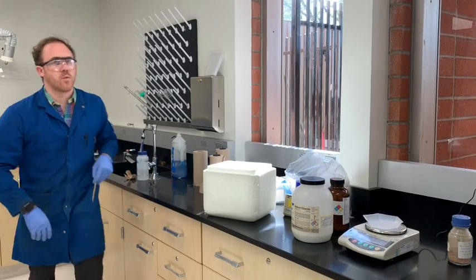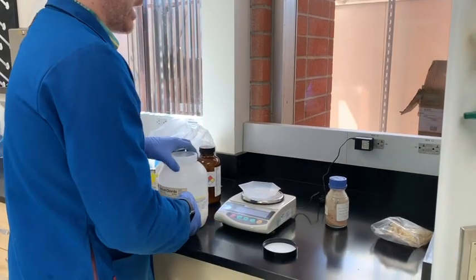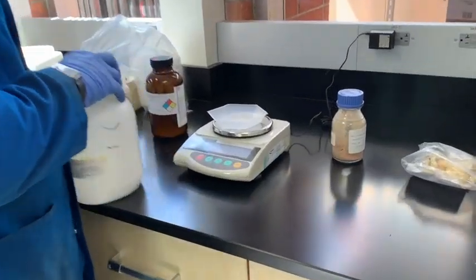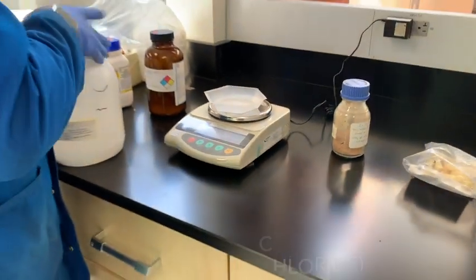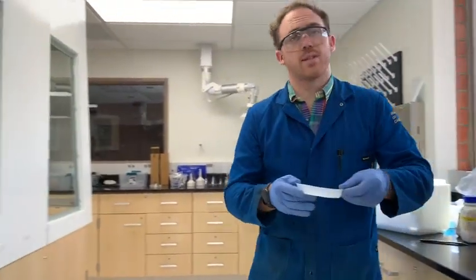We'll weigh out about 5 grams. This doesn't need to be perfect. This isn't going to affect the yield at all, other than maybe helping it salt stuff out. 5.03 grams. And so what we'll do is we'll just set this aside for now.